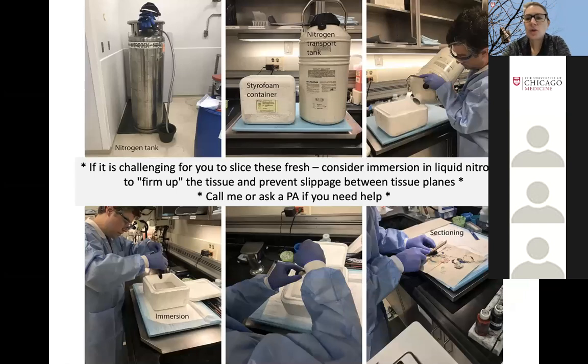Cool. So regarding liquid nitrogen, on the website and in person to some of you, I have discussed when or if to immerse a fresh specimen in liquid nitrogen to firm it up for cutting. I know that some of the PAs and some of the residents are very comfortable cutting these tongue specimens freshly.